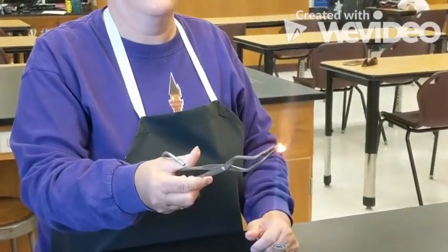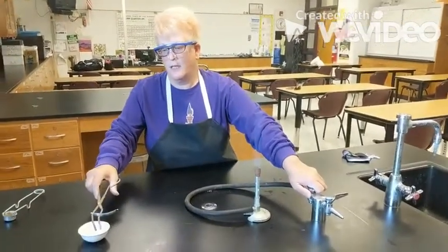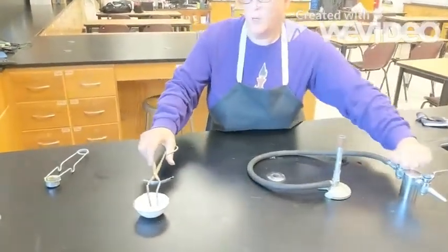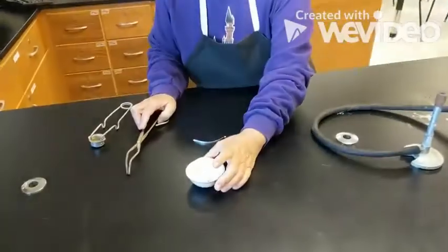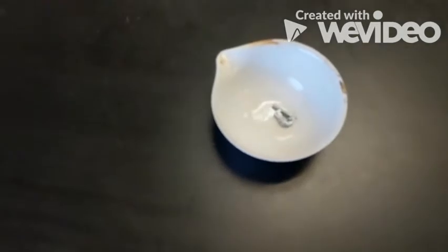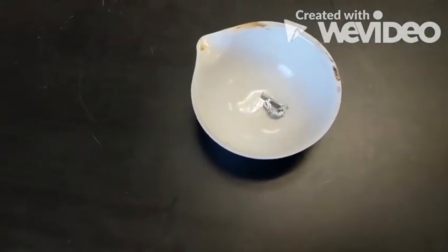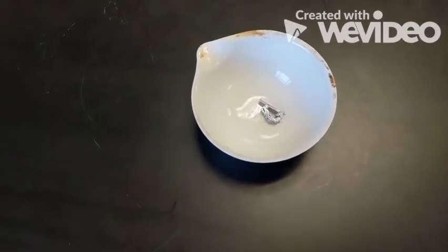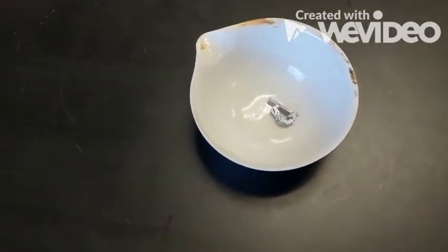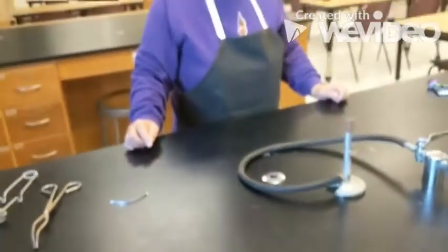I think we saw something happen there. So I'm going to put it in the evaporating dish here, and we're going to take a closer look at what it looks like now. So there's still a piece of magnesium that looks the way it did originally, but now there's some that looks a little different. So make sure you get your before and after observations, and you're trying to figure out whether it was a chemical change, a physical change, or possibly both.